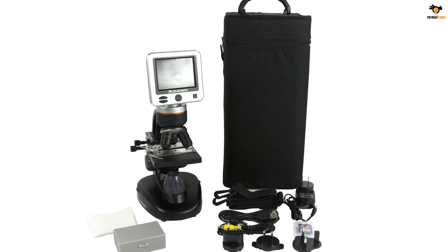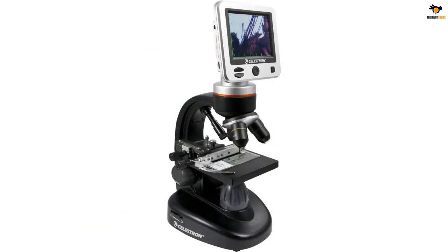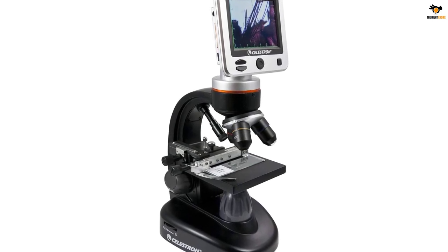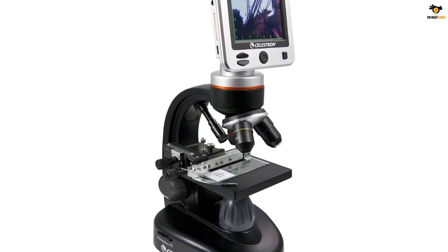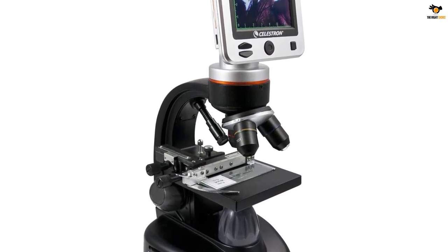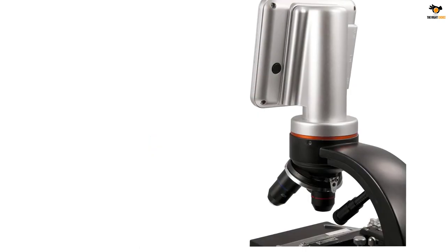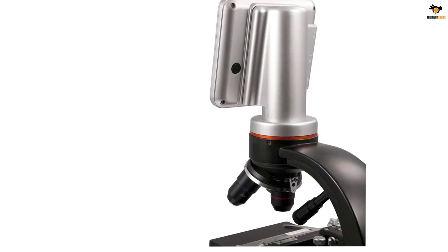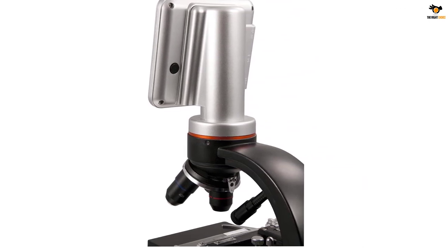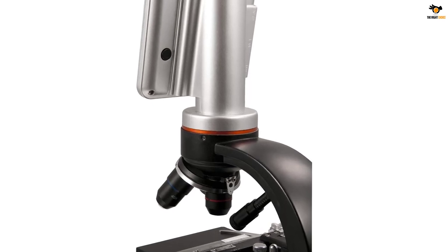While it may be quite powerful in terms of its magnification, you only get a small screen size of just 3.5 inches. It does include a decent 5-megapixel camera, and thanks to this camera and the high-quality optics, it is able to offer a very high zoom range of up to 1600x. Apart from being quite powerful, this digital USB microscope is also the most reliable one mentioned here, thanks to its 2-year warranty.